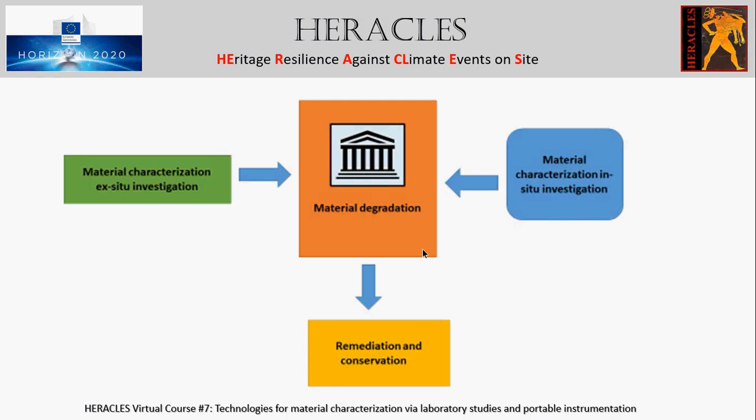It should be universal, so that by means of a single instrument, many materials and objects of various shapes and dimensions may be analyzed with minimal sample treatment.